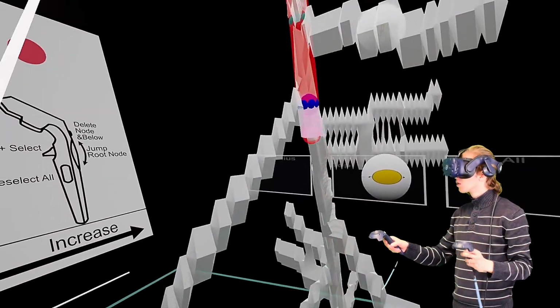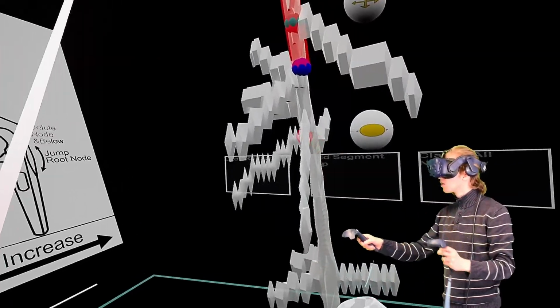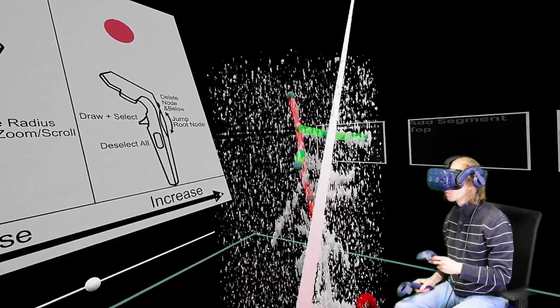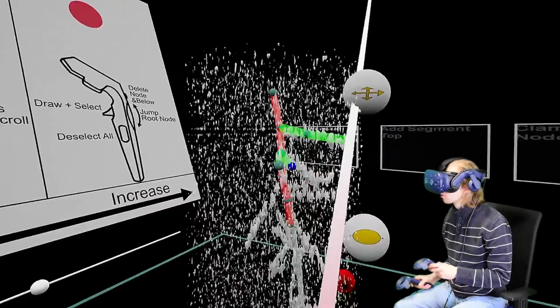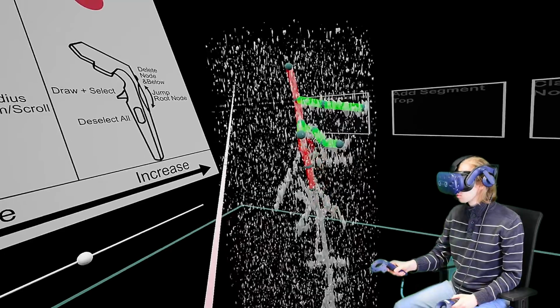New nodes will always carry over the diameter of the attachment parent, so it is good to set the correct diameter quite early. There is a lot of previous work on the question on whether to support sitting or standing, but for our purposes we chose to give the users the option to do either, especially relating to how they interact with the root system.